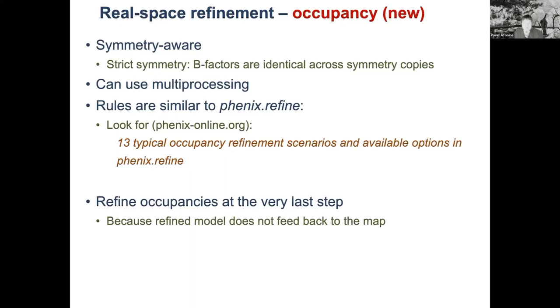And again, likewise to B-factor refinement, you do refine occupancies at the very last step for the very same reasons. Refined models in the case of cryo-EM do not feed back into your data, into maps. All right.